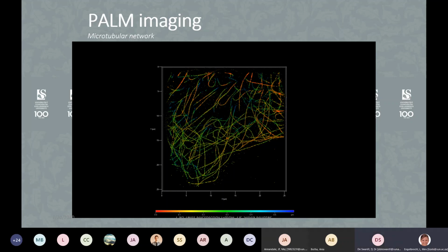Anyone else? I see a hand here. It's my hand. Yes. I quickly want to know, most of the images that I've looked at were confocal with Z stacking, to see if there's any interaction between the two molecules that I was looking at. In the Z stack, we can see if they are overlapping, if they occupy the same space. In terms of the palm imaging or the spatial orientation with the 3D palm, would that also be a possibility to track the depths if we struggle with the Z-stack, to see more or less where they lie and give different colors to the different fluorophores or not?